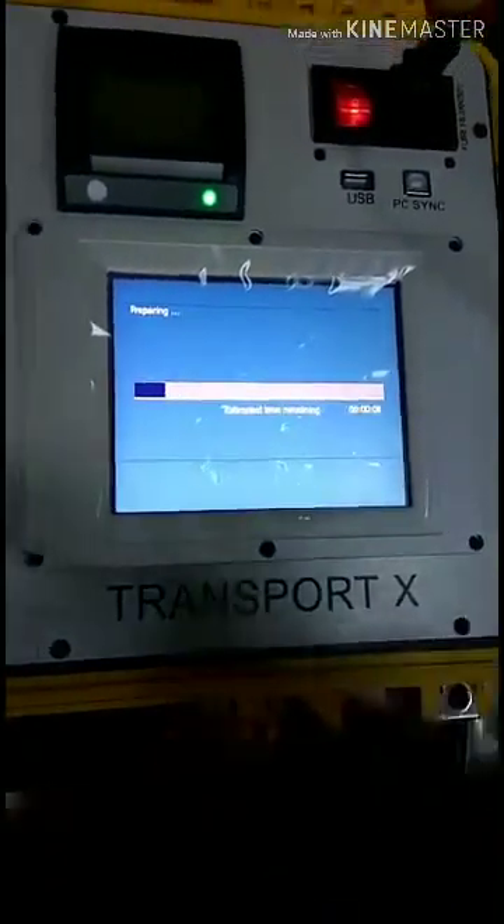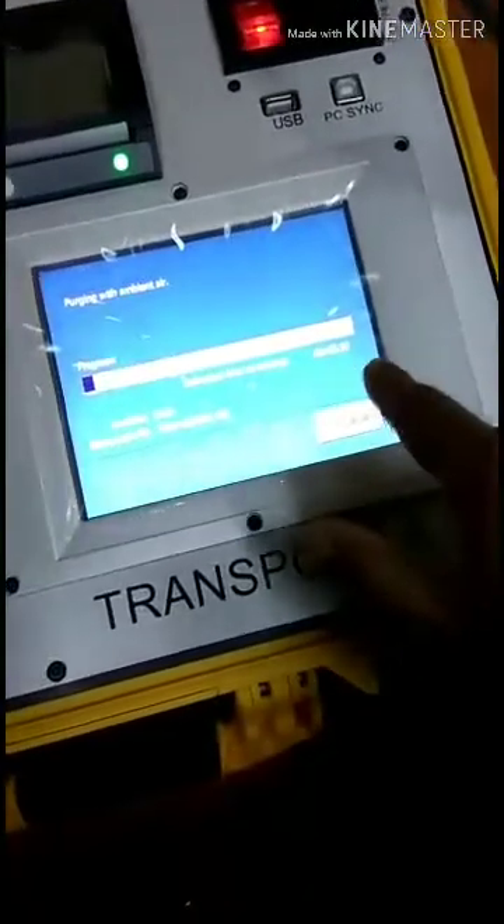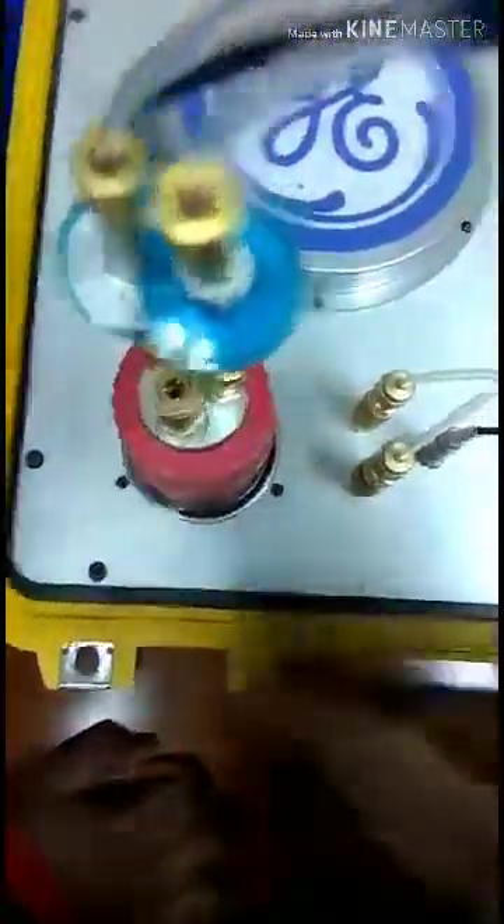Time is good. Time to 5 minutes — the time is good.